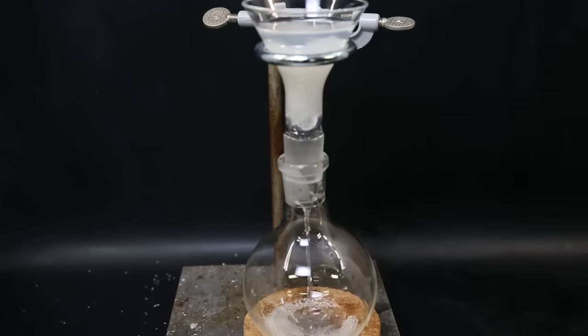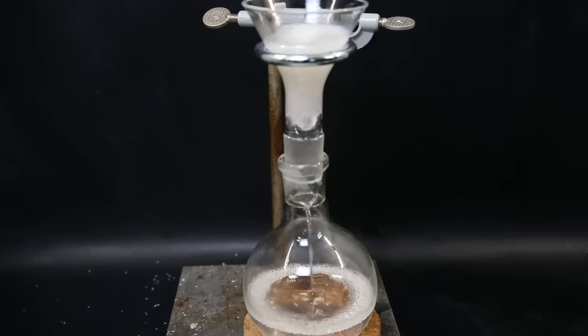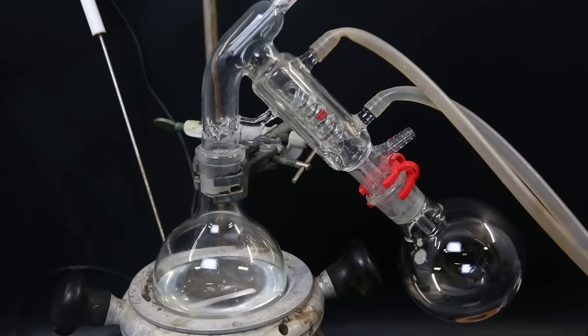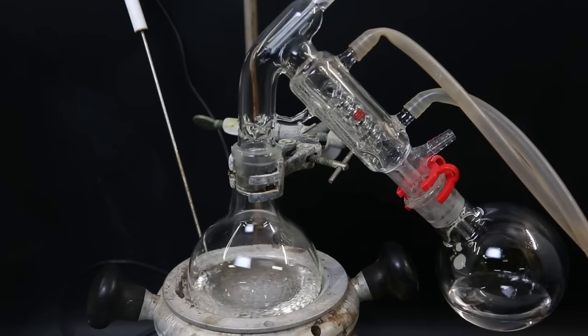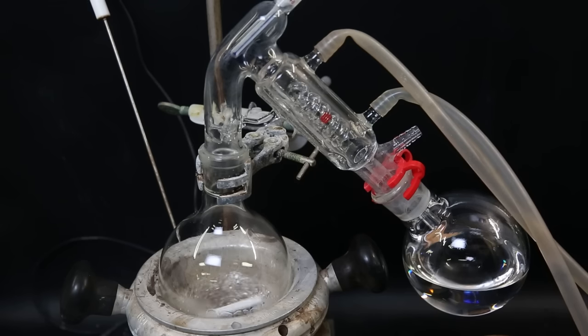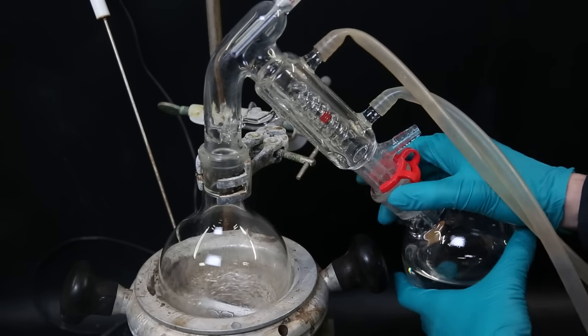I then filtered the mixture through some cotton directly into a flask. I then distilled the filtrate with short path distillation to boil off the THF and toluene. After a while, it stops coming over, so I swap the receiving flask.